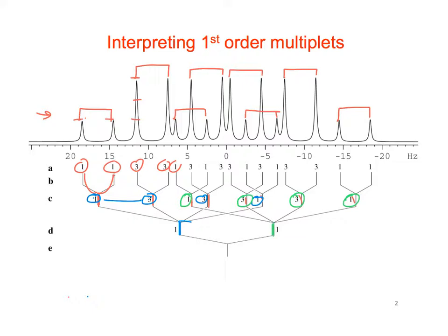Right. So then we come back to these 2, and then we see our last peak here. That would be the one with no splitting. So yes, we have this component of a doublet and a quartet and another doublet. Okay, and if we wanted to figure out what the coupling constants were here, then we would have to look at the distances for these different components, or we'd have to find the different components in the spectrum.